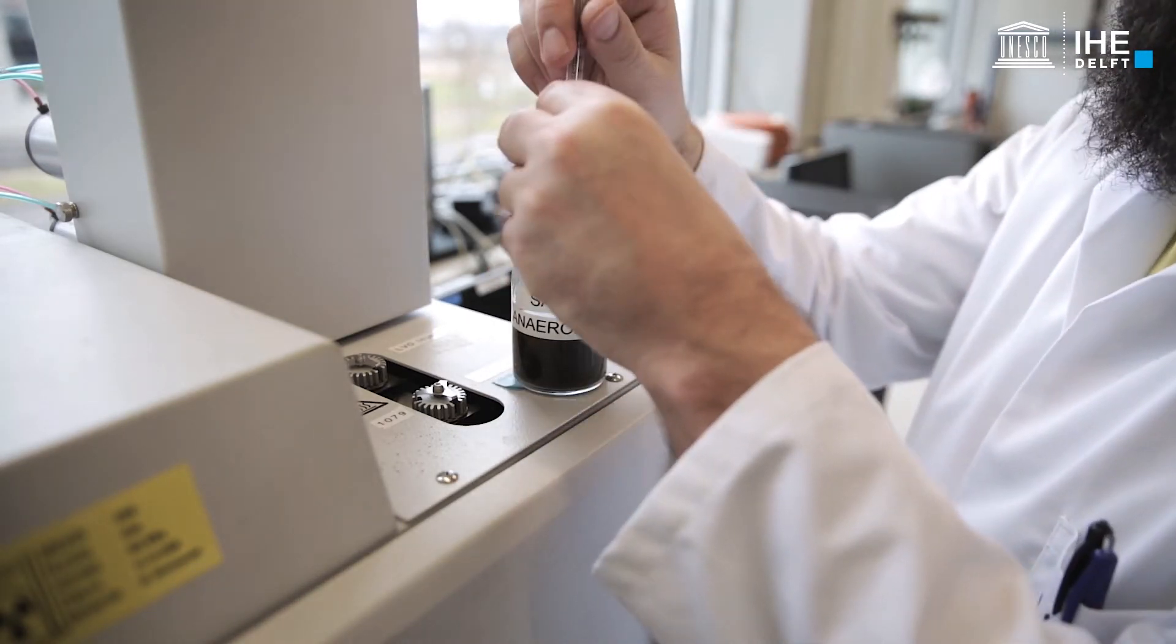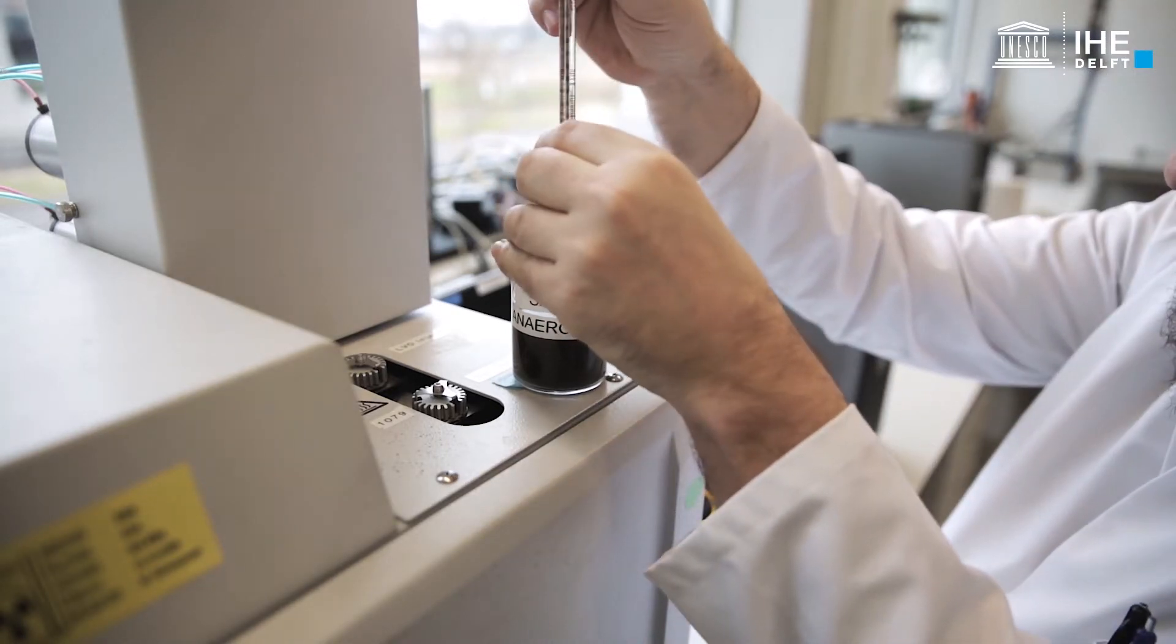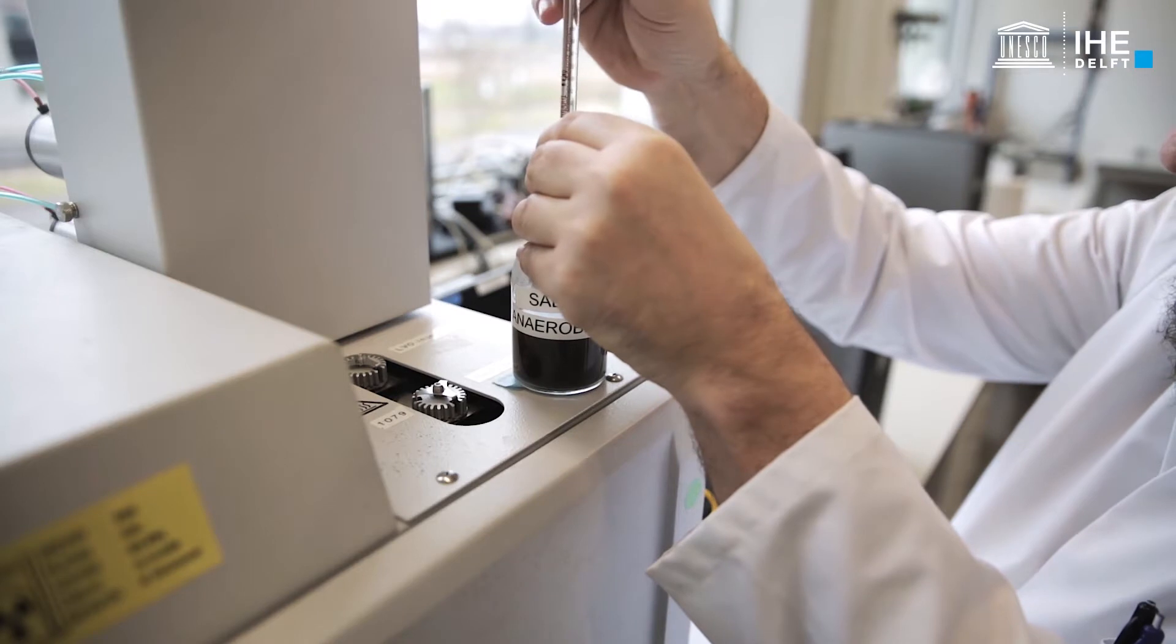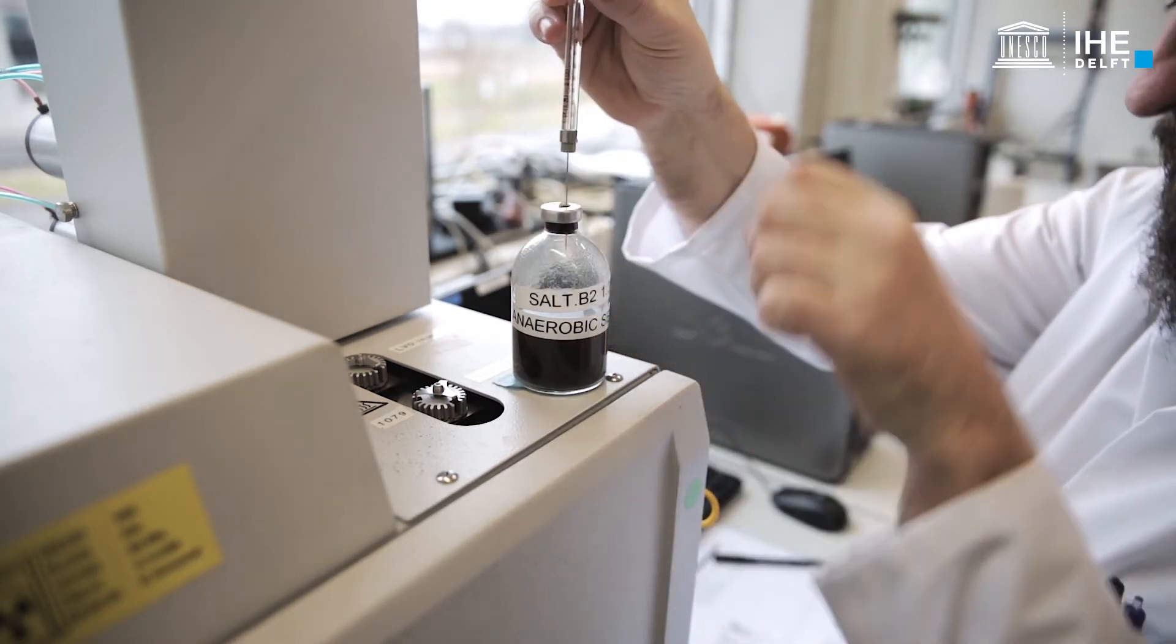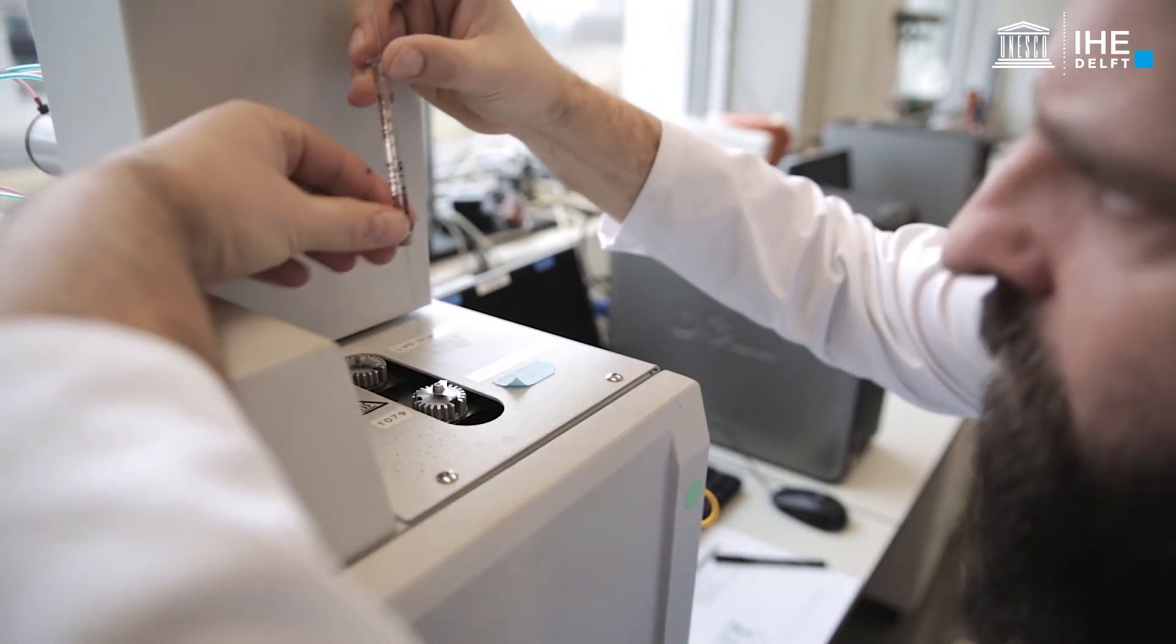After the gas pressure in the headspace has been brought to atmospheric pressure and the volume expansion measured, the headspace is sampled with the gas syringe and the methane and or nitrous oxide concentrations are determined by gas chromatography.